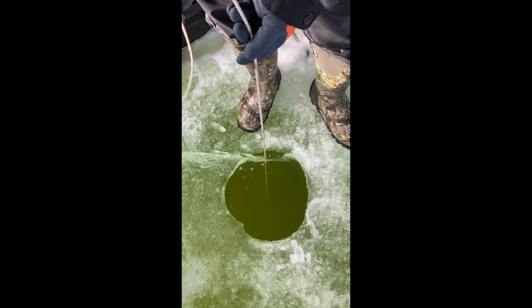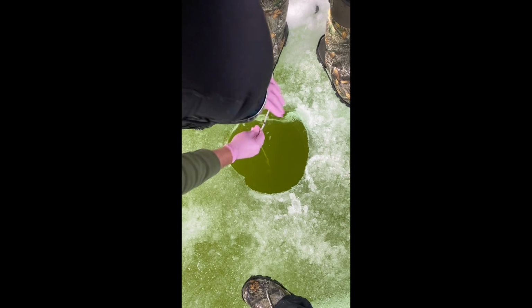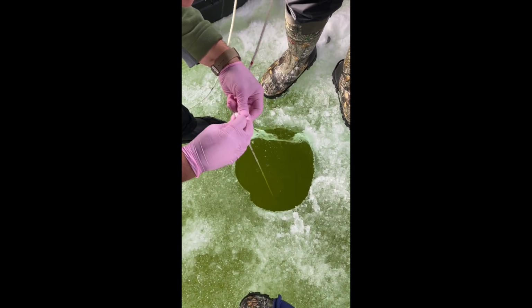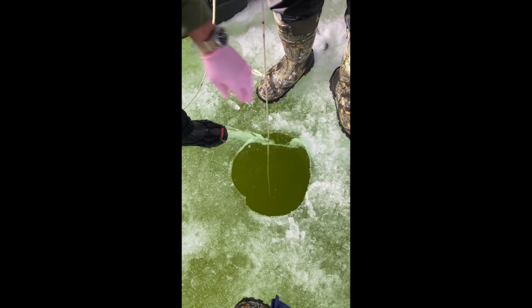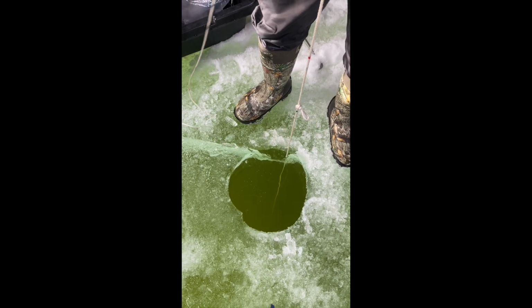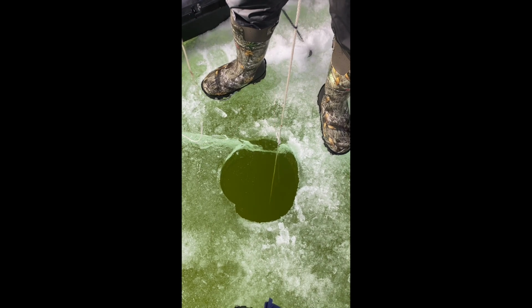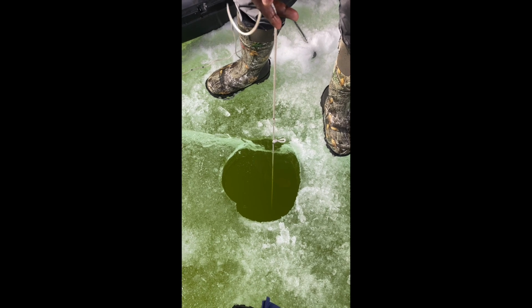Because we're going to be doing quite a few tows from this depth, just so we don't have to count every time, what we find helpful is tying a little loop at 8 meters, so now we don't have to think or count next time we're doing this. All the way to 8. Okay, and then we do a slow tow on the way up.